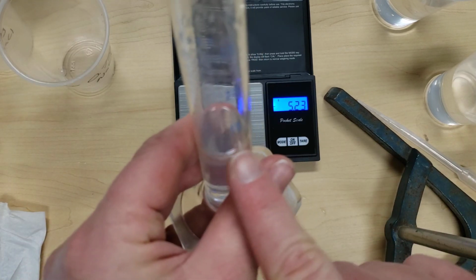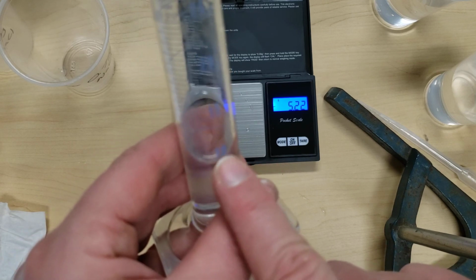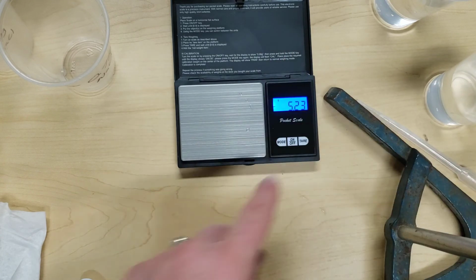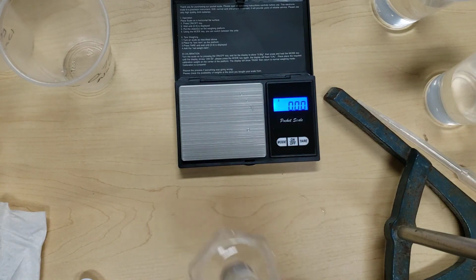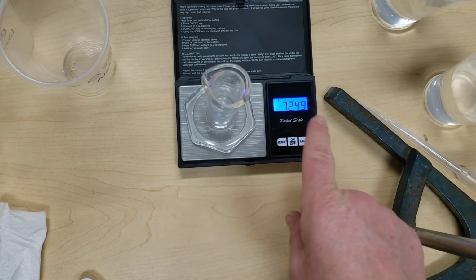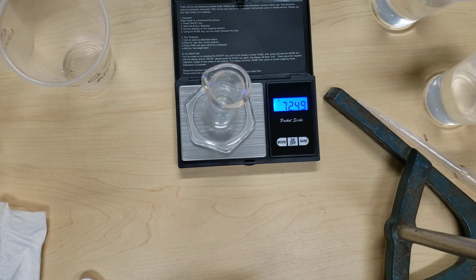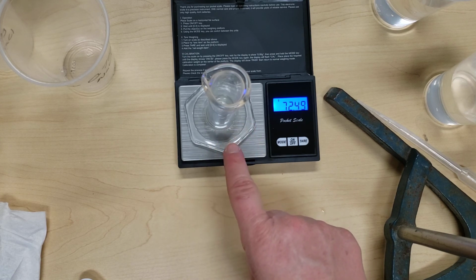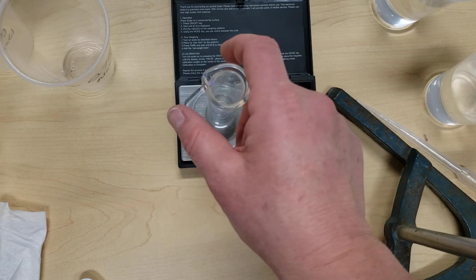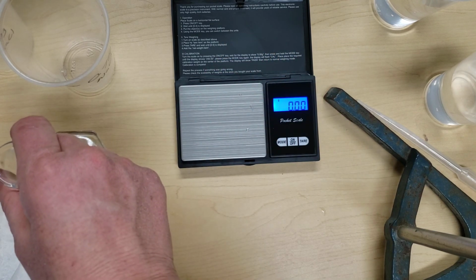We want to record the volume accurately using the measurements on the graduated cylinder. Then balance to zero, and record the mass so that we can subtract off our graduated cylinder and find the mass of just the liquid. Mass divided by volume gives us our density.